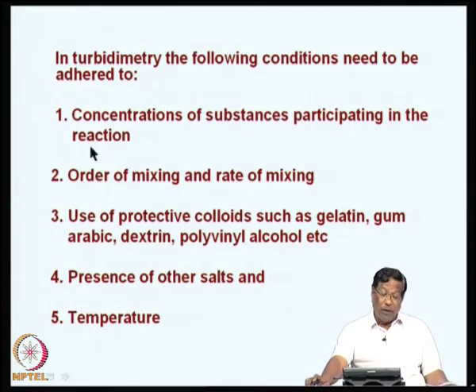Now, in all these things, the rate of mixing I have not explained to you very properly, because this is a very special aspect of turbidimetry. You can use hand mixing, you can use machine mixing, etc., shake the substance.